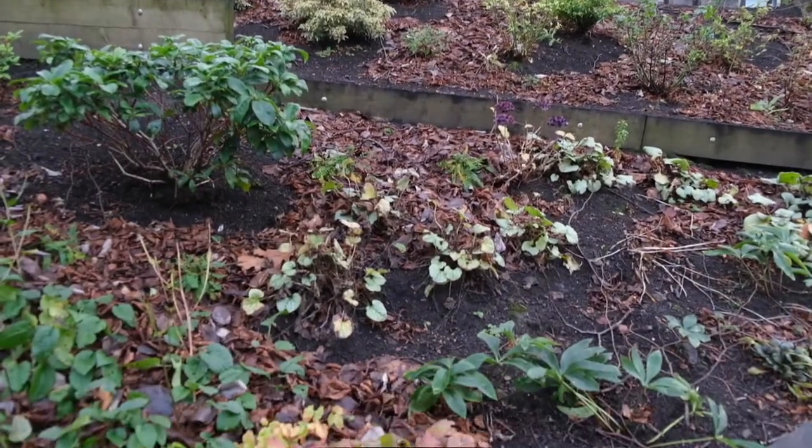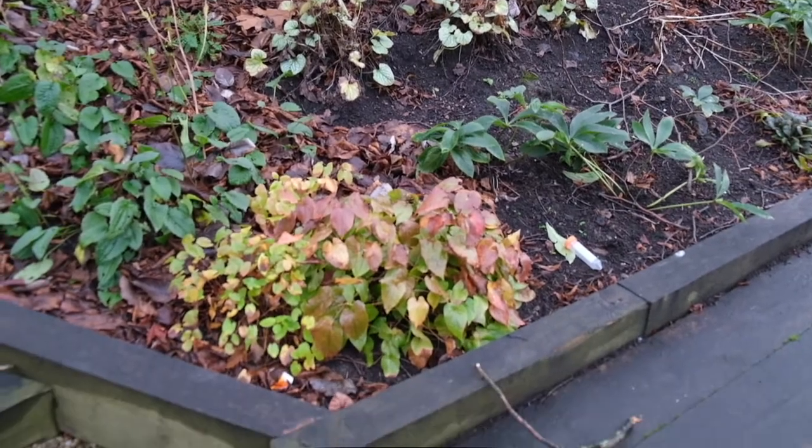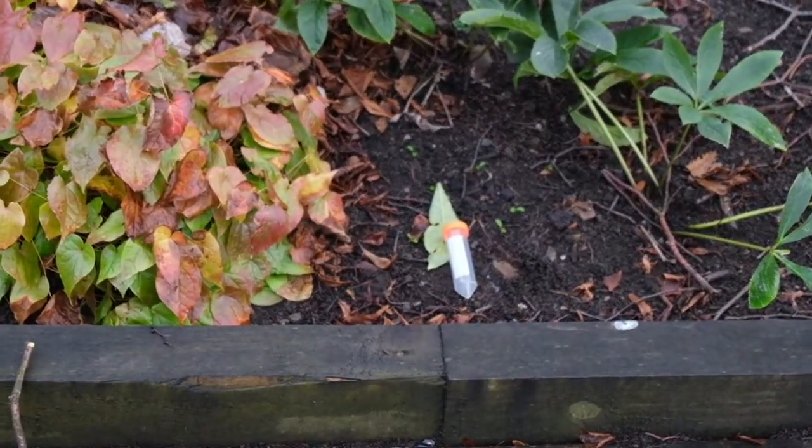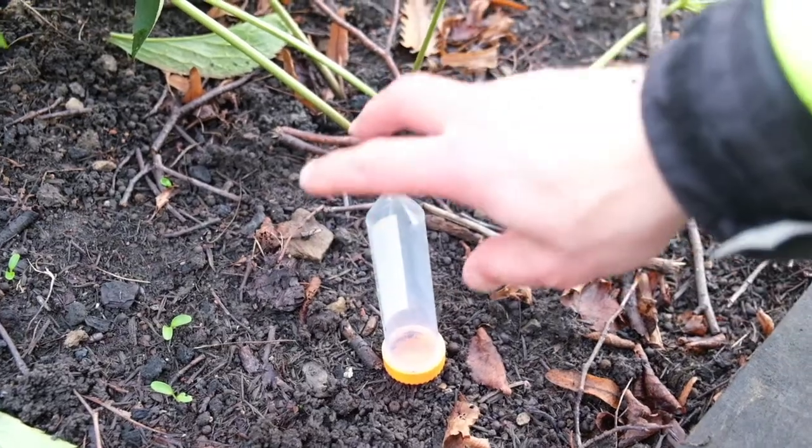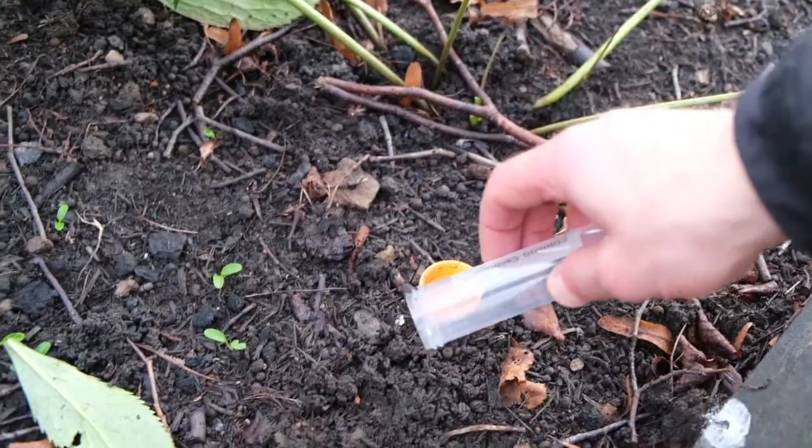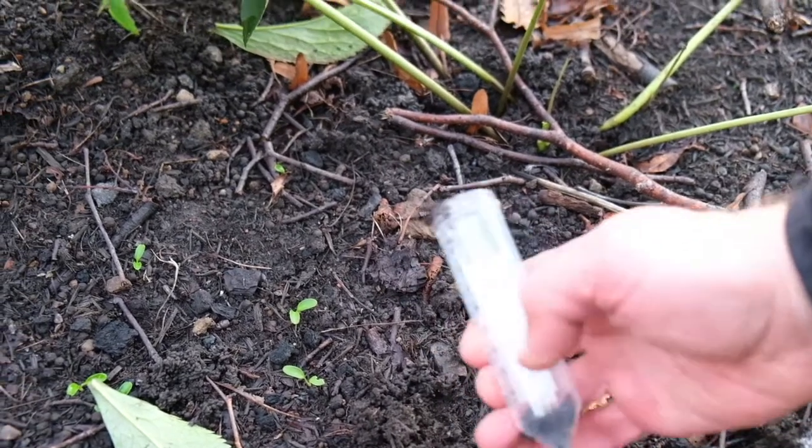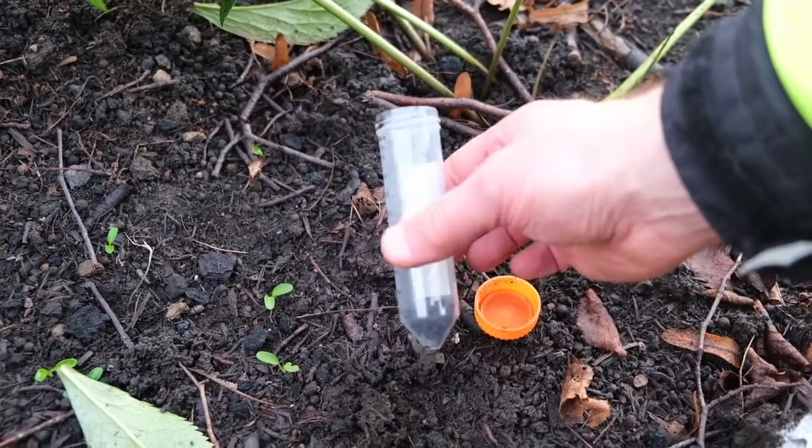We are taking our first sample from this garden just outside the Davidson Building in the University of Glasgow. We will take our sample using a 50mm plastic corning tube. Without touching the soil or the inside of the tube, scoop up a small sample of soil and put the lid back on the tube.